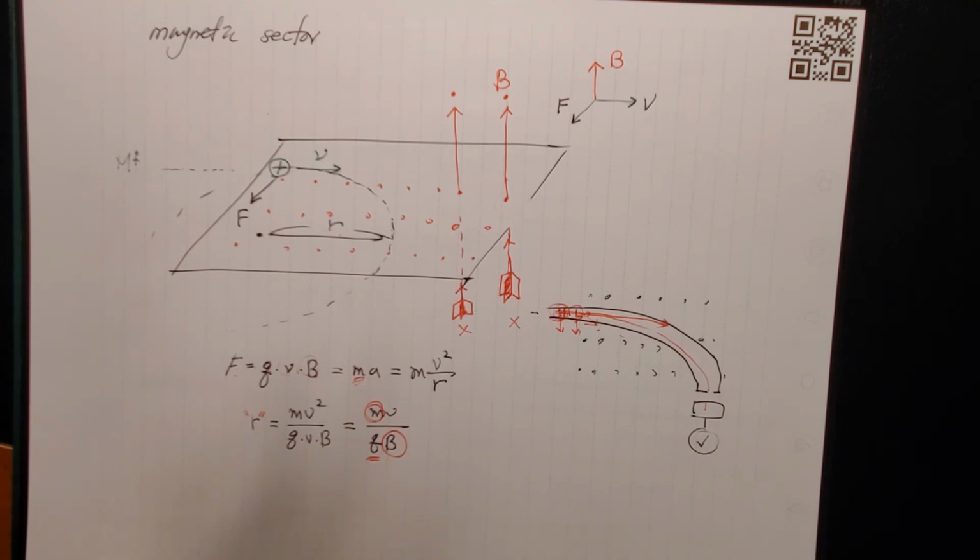Or nowadays, like FT, you are detecting the frequency of those charged particles generating electric field oscillation, and you are able to get the frequency of each using Fourier transformation we talked about before.